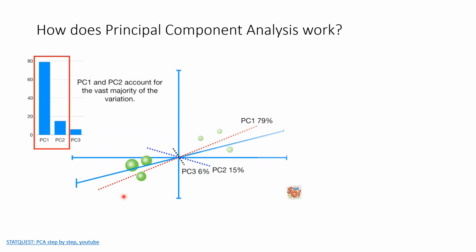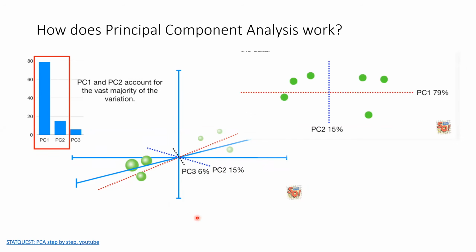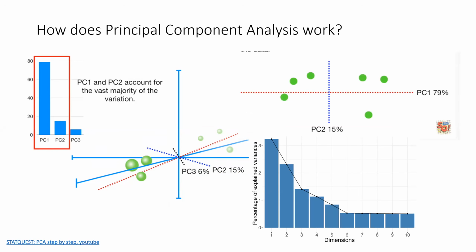And then after a certain number of dimensions, we often find a plateau in the variance explained, where adding additional PCs only contributes a minimal amount of variance explained. So this here is considered the elbow dimension, and it determines the number of PCs that we want to use in the distance matrix. And we can see that the first PCs tend to capture a large amount of the variance in our data.